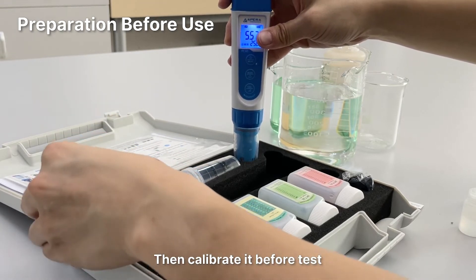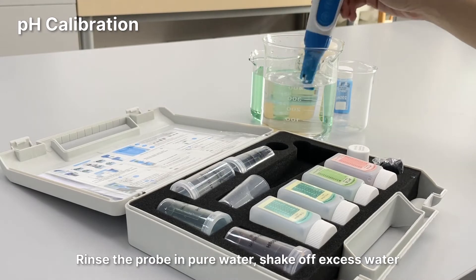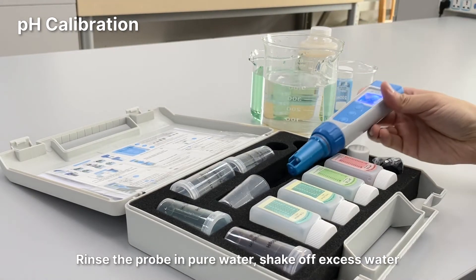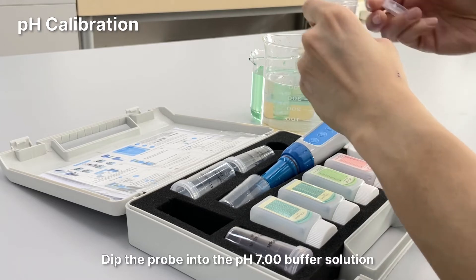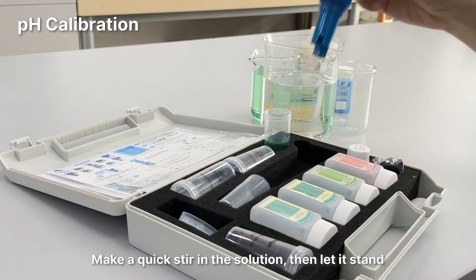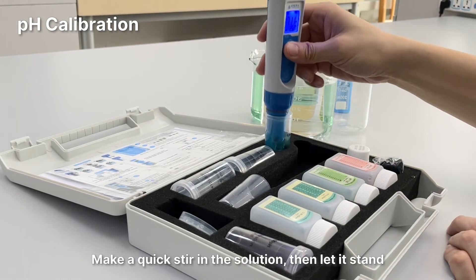Then calibrate it before test. pH calibration: Rinse the probe in pure water and shake off excess water. Dip the probe into the pH 7 buffer solution. Make a quick stir and let it stand.